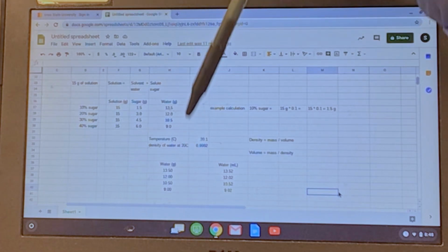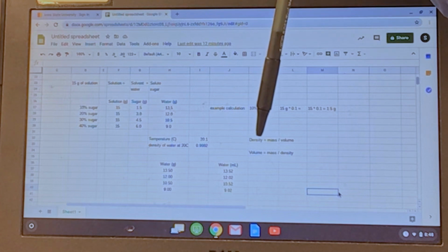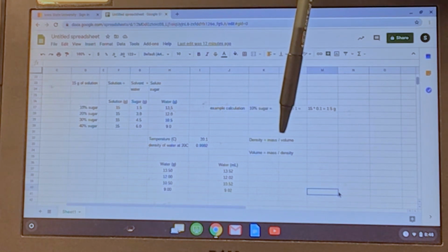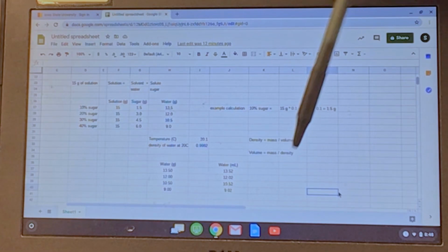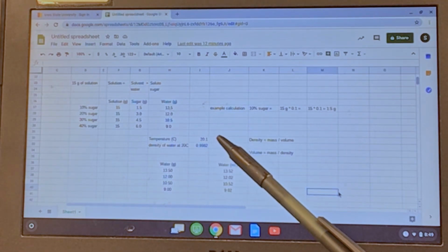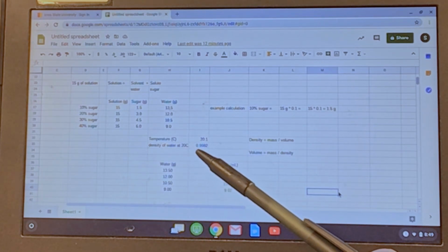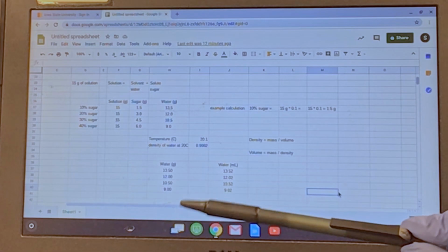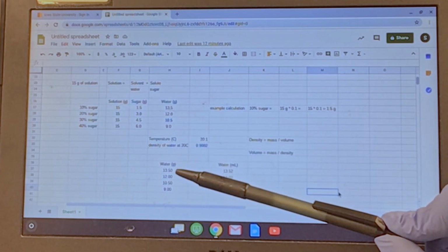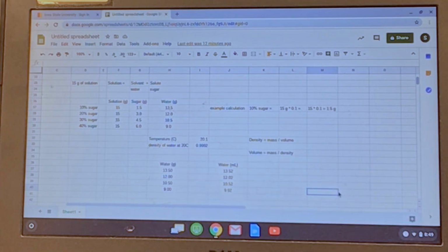Remember that the volume of the water is related to the mass through the density. Density equals mass over volume, and therefore volume equals mass divided by density. I measured the temperature of my water, which is 20.1 Celsius. The density of water at 20 degrees is 0.9982, and therefore 13.5 grams of water correspond to 13.52 milliliters of water, and so on for all the other amounts.